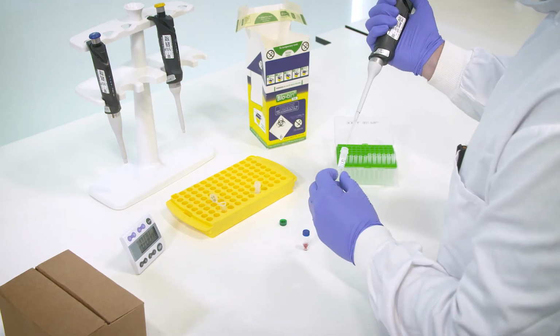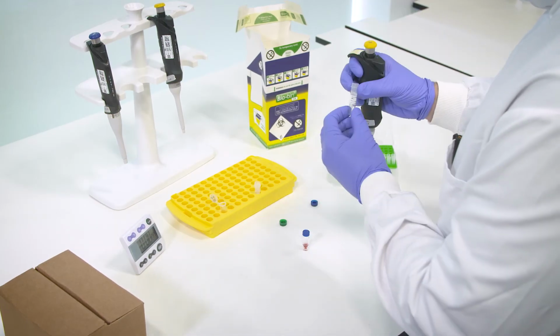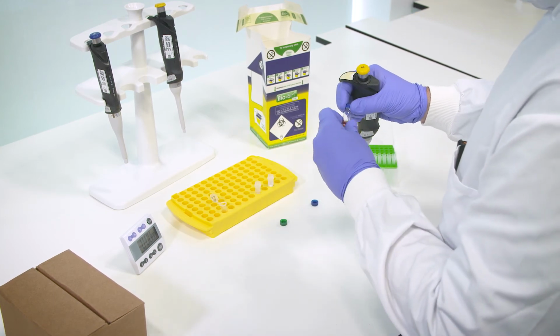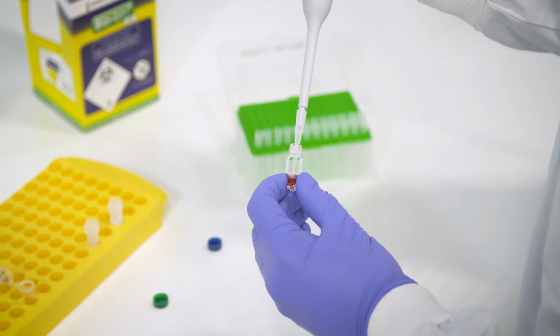Then add 1 microliter of rapid quencher for every 10 microliters of antibody used. Your conjugated antibody can be used after 5 minutes.